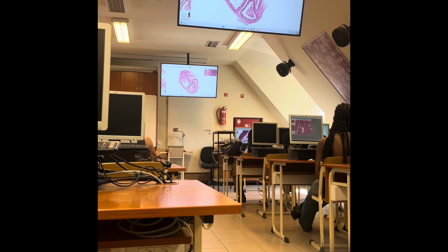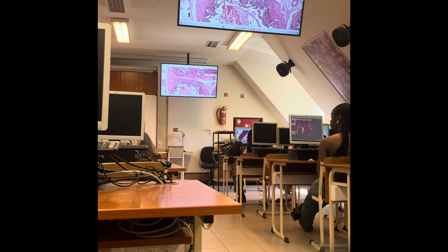Okay, so then we can assume that this smaller upper structure is the ductus deferens, and the rest of the luminated structures belong to the seminal vesicle. So you can see that segment where these two organs are very close to each other, and they will eventually unite to form the ejaculatory duct.